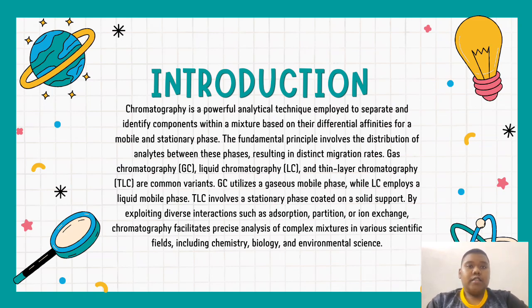GC utilizes a gaseous mobile phase, while LC employs a liquid mobile phase. TLC involves a stationary phase coated on a solid support. By exploiting diverse interactions such as adsorption, partition, or ion exchange, chromatography facilitates precise analysis of complex mixtures in various scientific fields, including chemistry, biology, and environmental science.